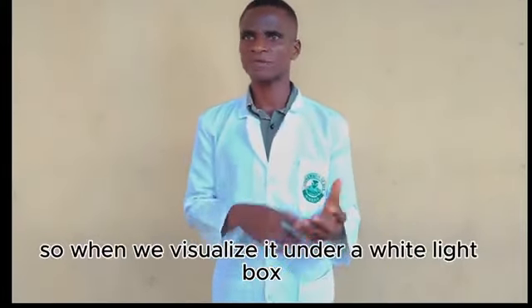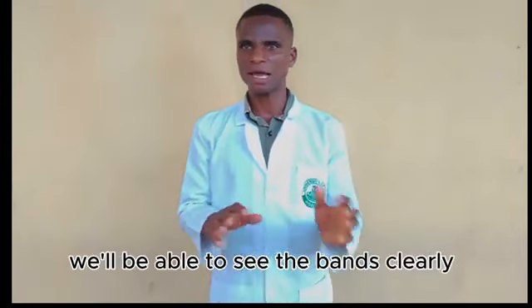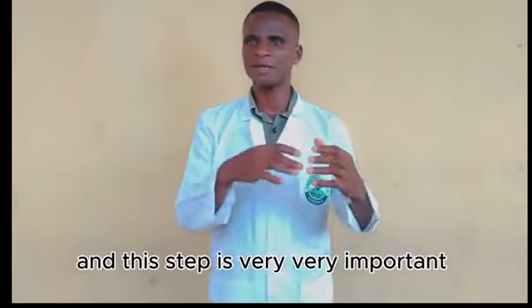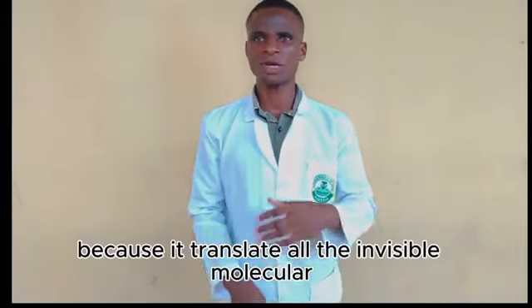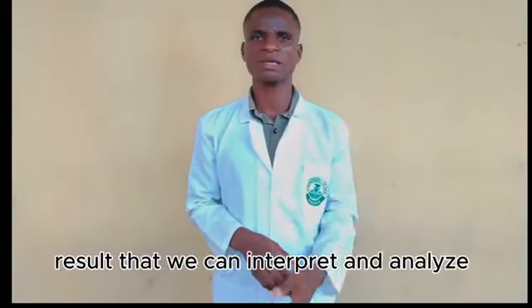So when we visualize it under a white light box, we'll be able to see the bands clearly. And this step is very important because it translates all the invisible molecular processes into a clear and visual result that we can interpret and analyze.